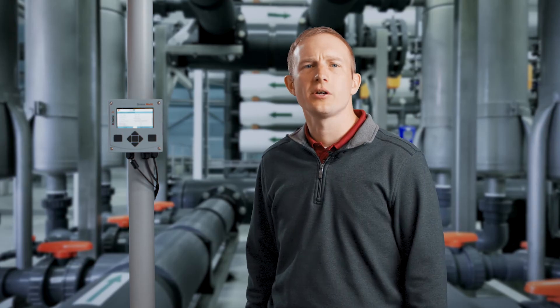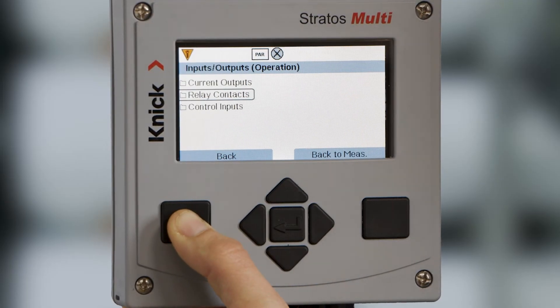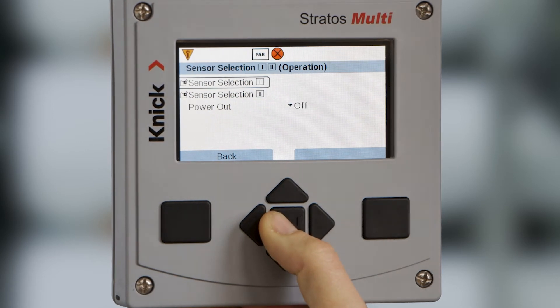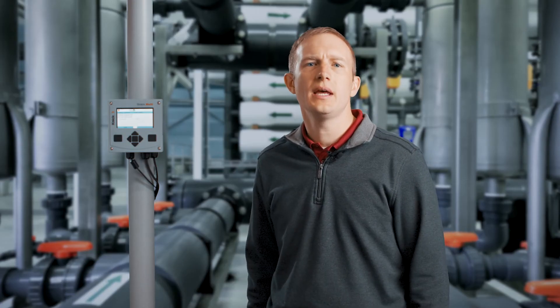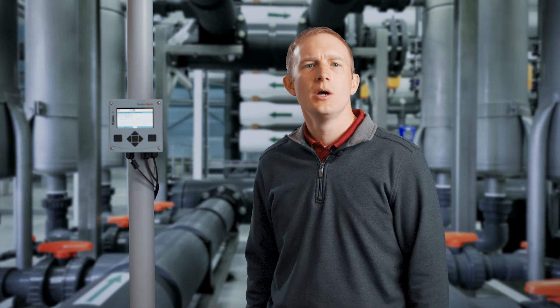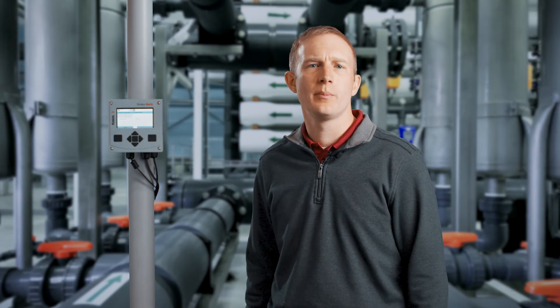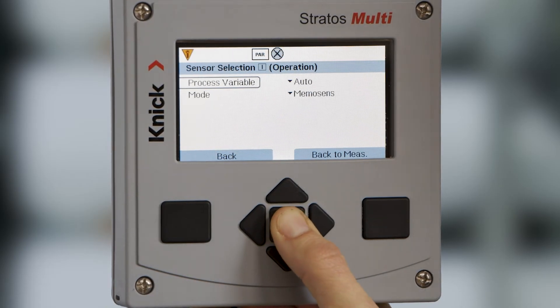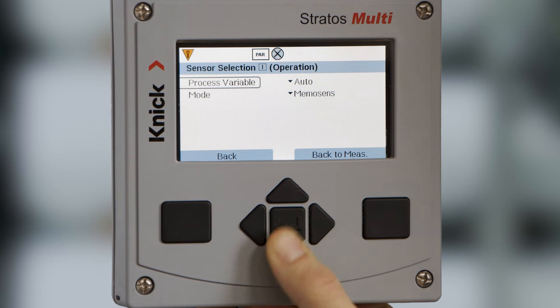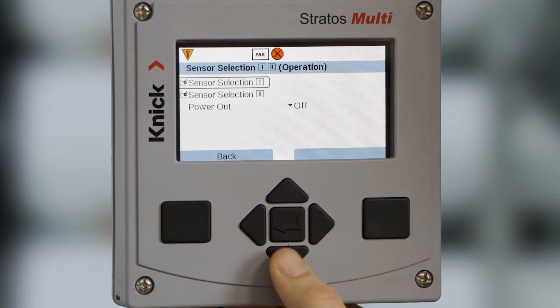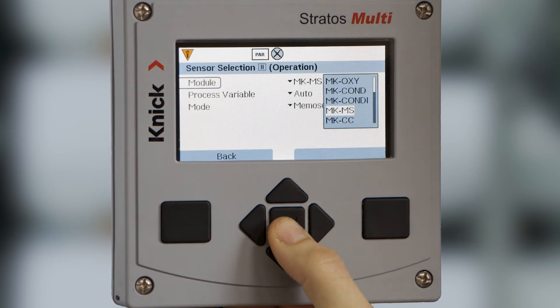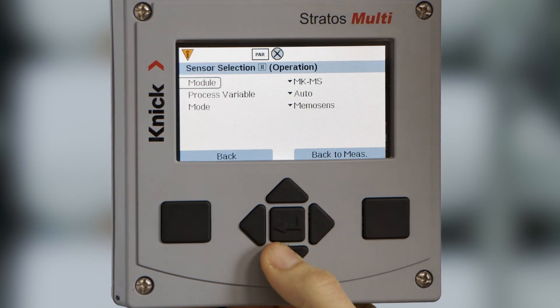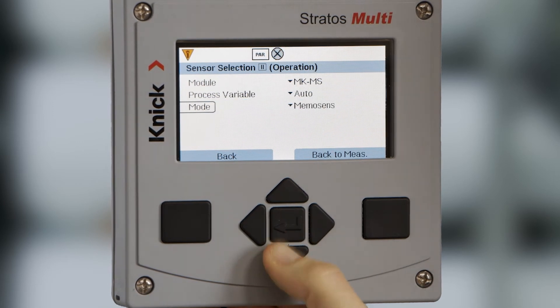Once the inputs and outputs are configured, we can then move on to our sensor selection, found in the main parameter settings menu. The Stratus Multi is capable of taking in up to two sensor inputs with the installation of an additional measuring module. By pressing enter on sensor selection, we can configure our process variables for both channel 1 and channel 2. Because both of our sensors are MemoSense sensors, we will select auto recognition for the process variables.